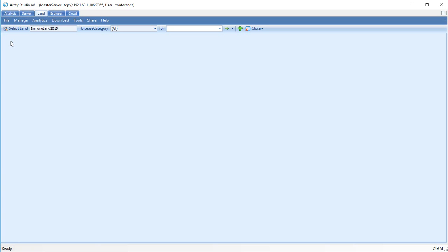This video tutorial is an overview of ImmunoLand, Omicssoft's database and interface to tens of thousands of carefully processed and curated data samples related to immune system diseases. These are focused heavily on gene expression microarrays and RNA-seq data. ImmunoLand is primarily focused on comparisons, such as comparisons between disease and normal tissue, or between two diseases, or between treatment and control. Thus, the views tend to be tailored toward analyzing these comparisons.